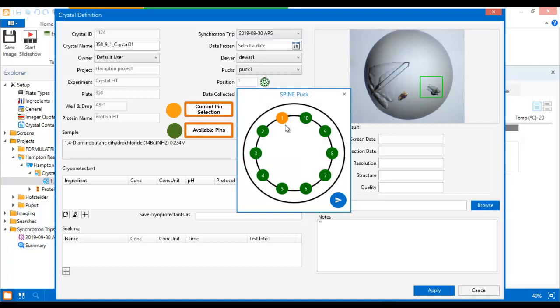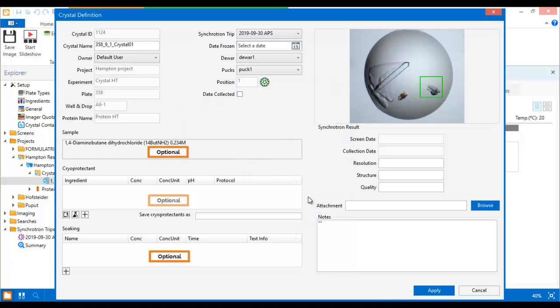In the graphic that appears, you can see which pins are available and move your crystal to any available pin. The other fields in this window are optional and allow you to make more detailed notes about your crystal if you wish.